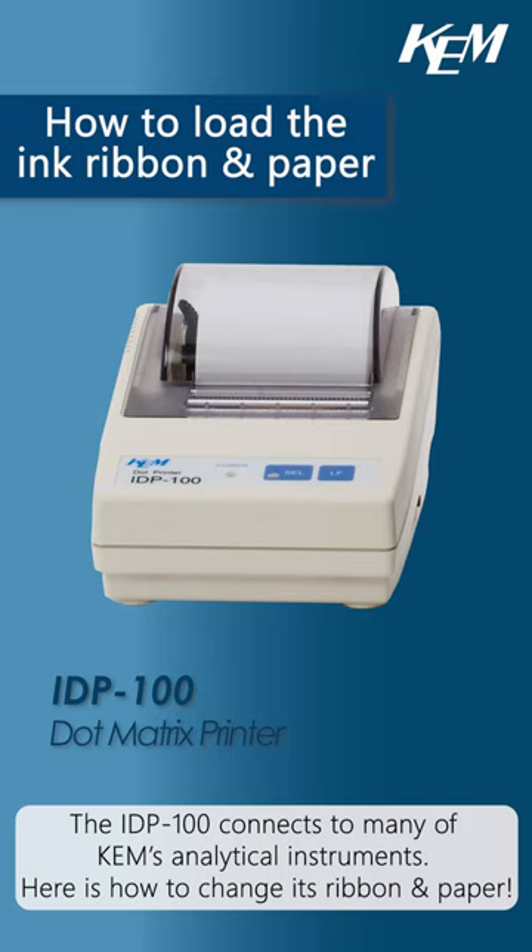The IDP100 connects to many of KEM's analytical instruments. Here is how to change its ribbon and paper.